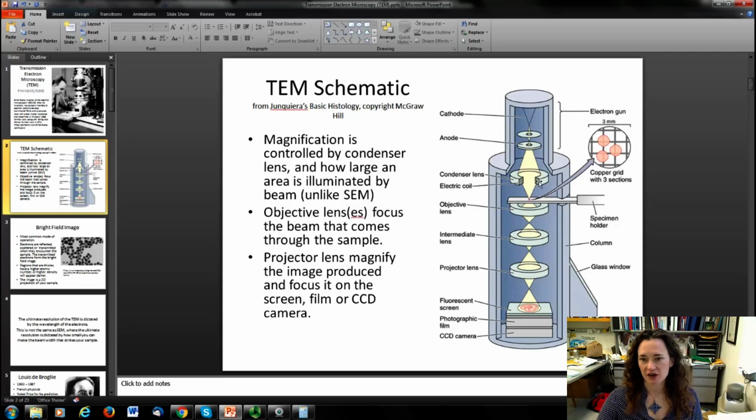The first thing they encounter is the condenser lens here. Now, the lenses in SEMs and TEMs are basically the same idea, okay? They're electromagnetic lenses. You pass currents through the lens, and then that generates a magnetic field. And through the Lorentz force law, F is equal to qv cross B, that steers the electrons and forces them to condense to form a probe.